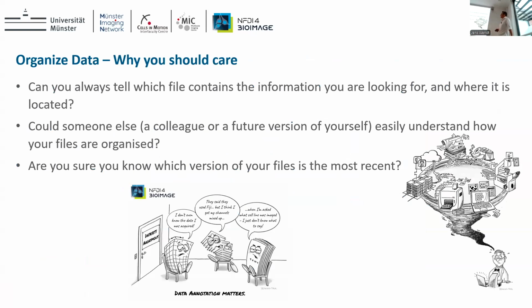So, why you should organize your data. Maybe I can skip this. The question is if you can always tell which file contains which information you're looking for. Do you know if a future version of yourself, or your PI in 5 years, if you are already at another university, knows where to find your data, understands your data, and are you always sure which version of a file is the latest? This is maybe not so much for microscopy, there you always have the raw image, but for analysis, which was the last file I used.